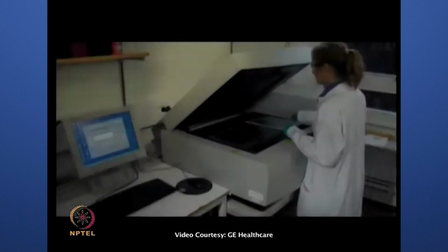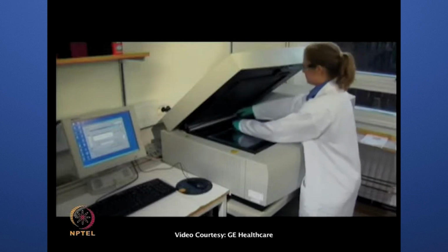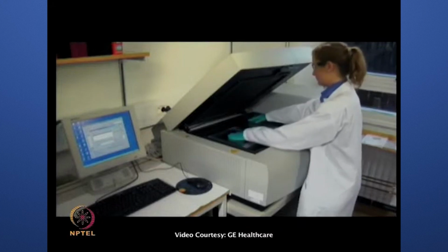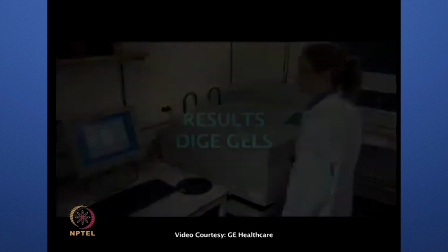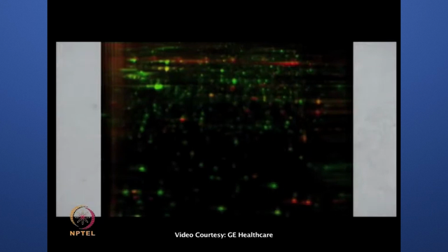After the second dimension electrophoresis, the gel cassettes are placed by using the grippers in the Typhoon fluorescent imager. 2 gels and 3 channels can be scanned simultaneously. The result from this 2D gel shows high resolution of membrane proteins in the sample, even if there are some known restrictions for hydrophobic proteins to be detected in a 2D gel.